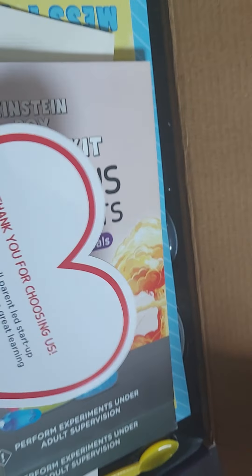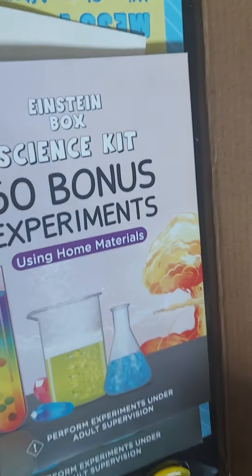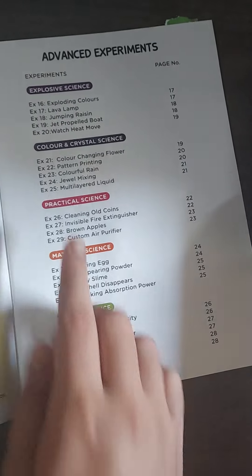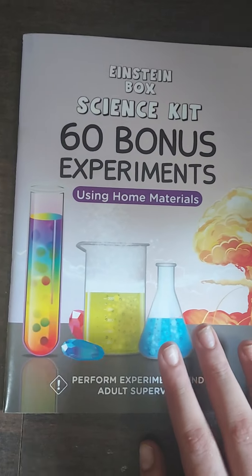Inside the box, the first thing is a card. Here is a message: 'Thank you for choosing us' — a message from the company. There's also a science kit instruction manual. On the box it says 'Einstein Box,' and this kit has a lot of experiments.